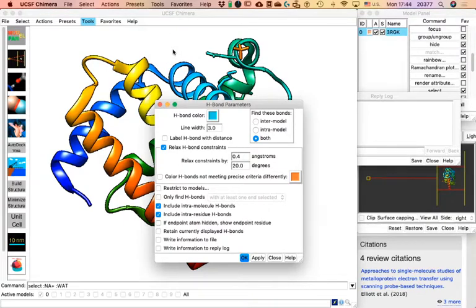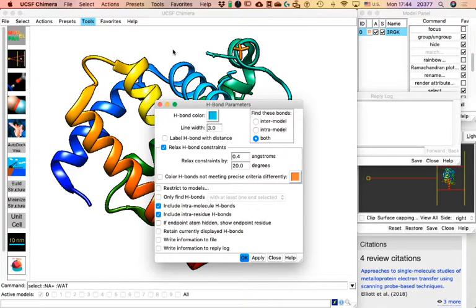You can change it if you want — it only changes the display, not the calculation. The parameters for the calculation are defined from these options, and they should be pretty much the same. Remember: if you click Apply it calculates and leaves the window open; if you click OK it closes the window. I'll click OK.